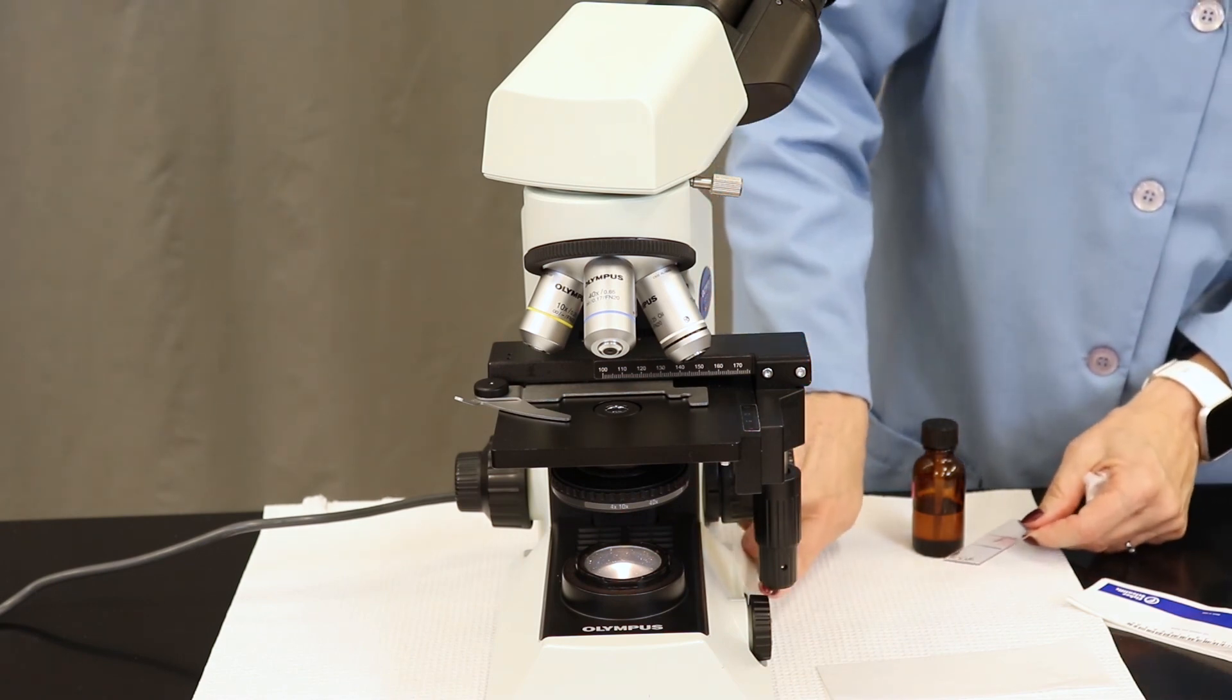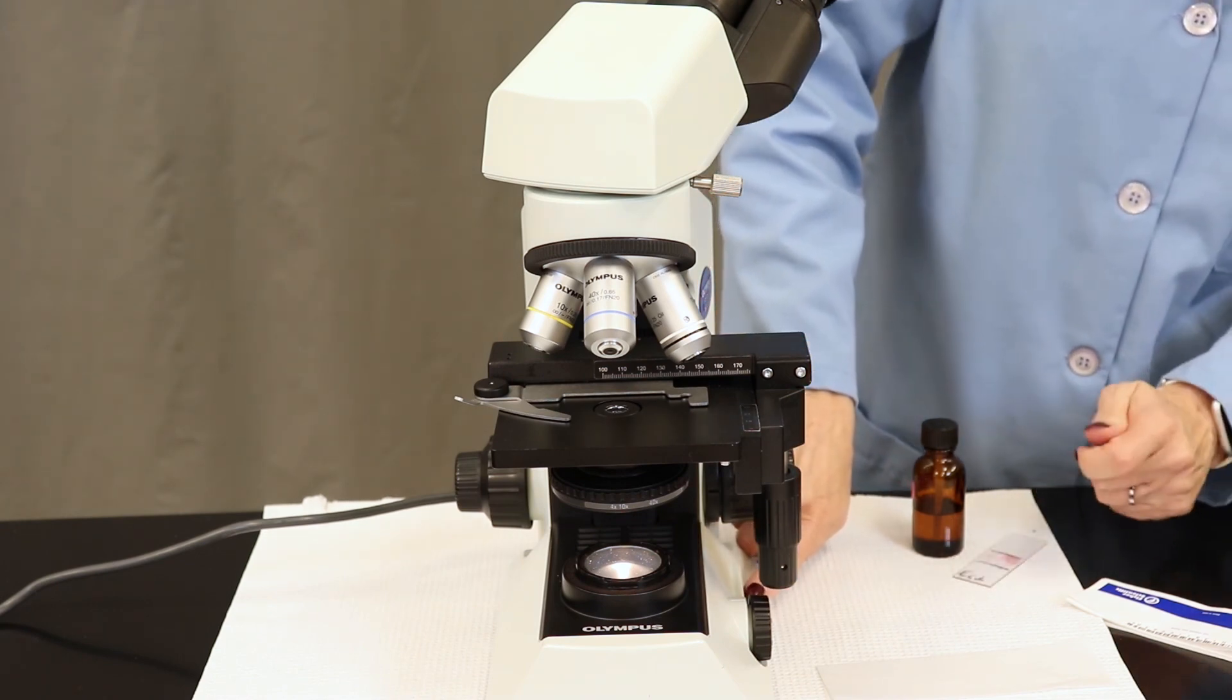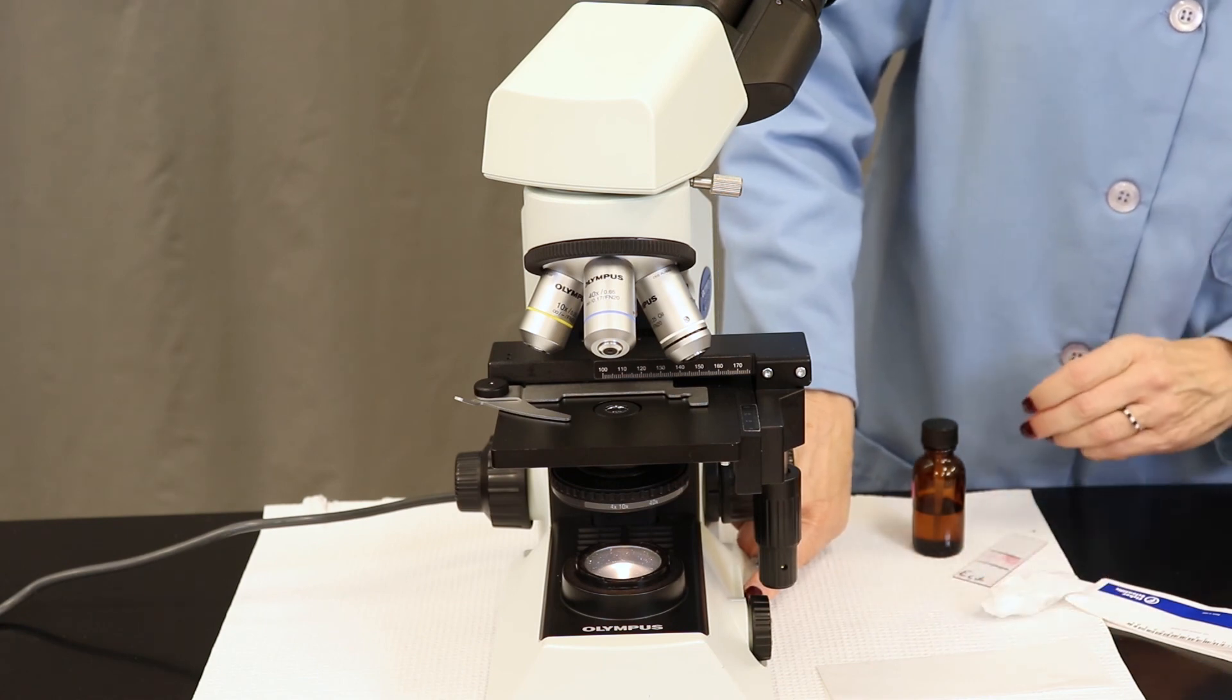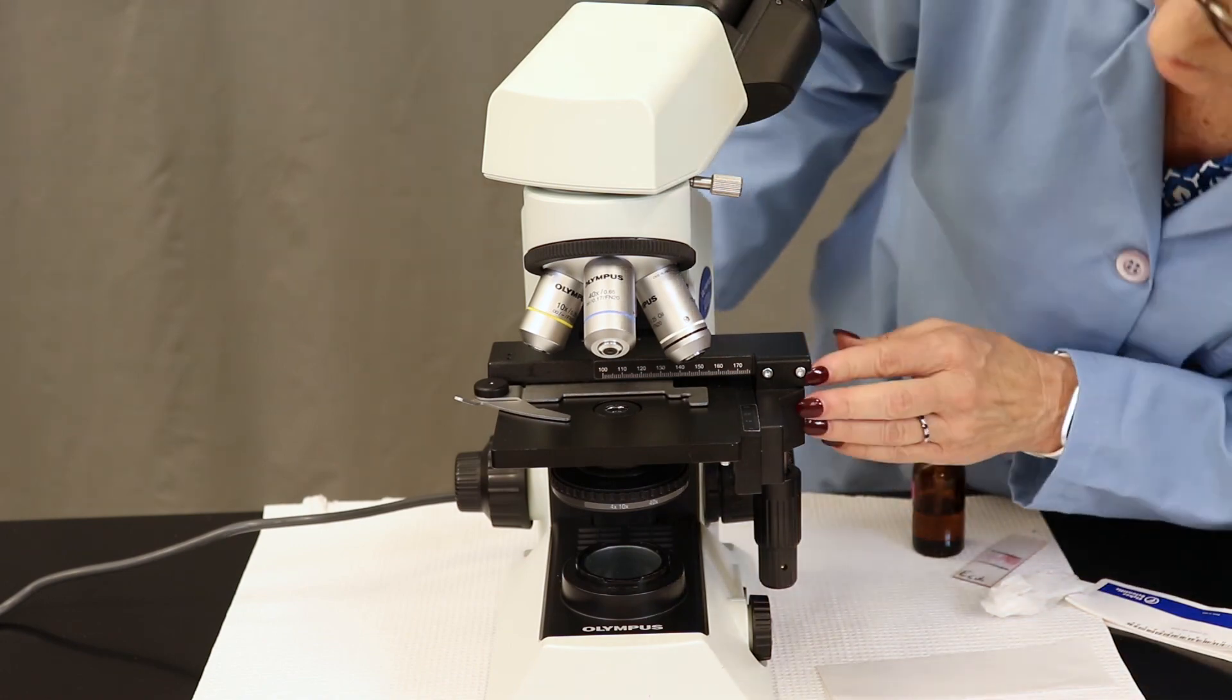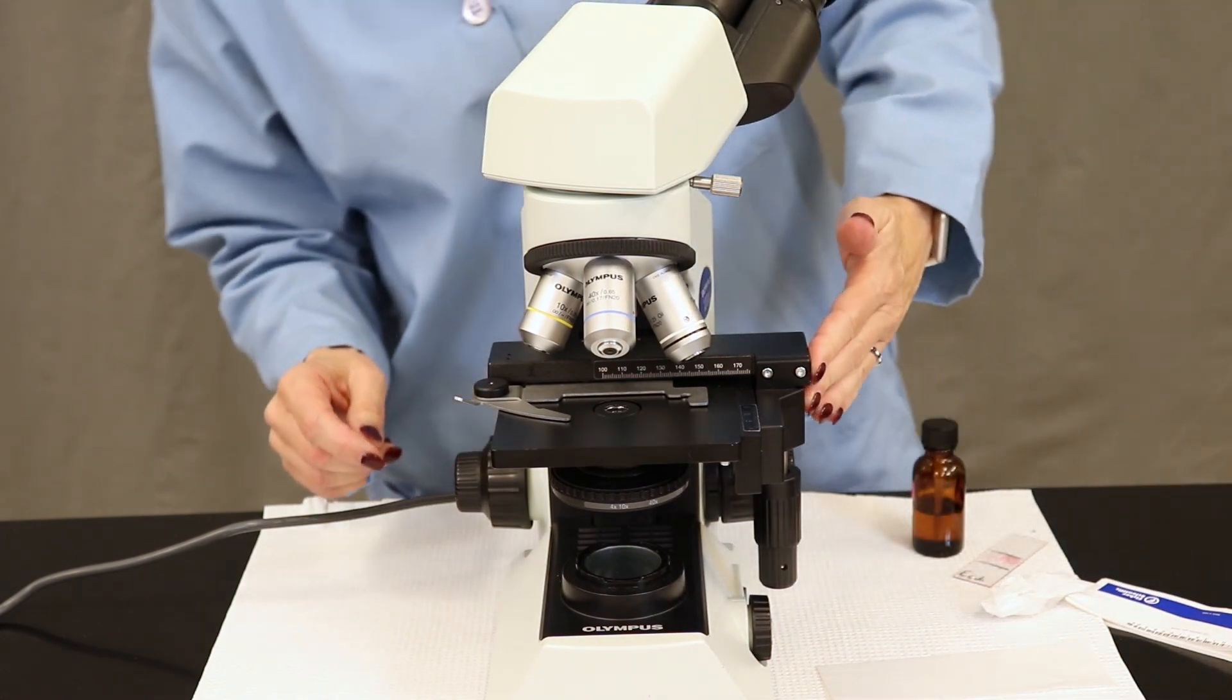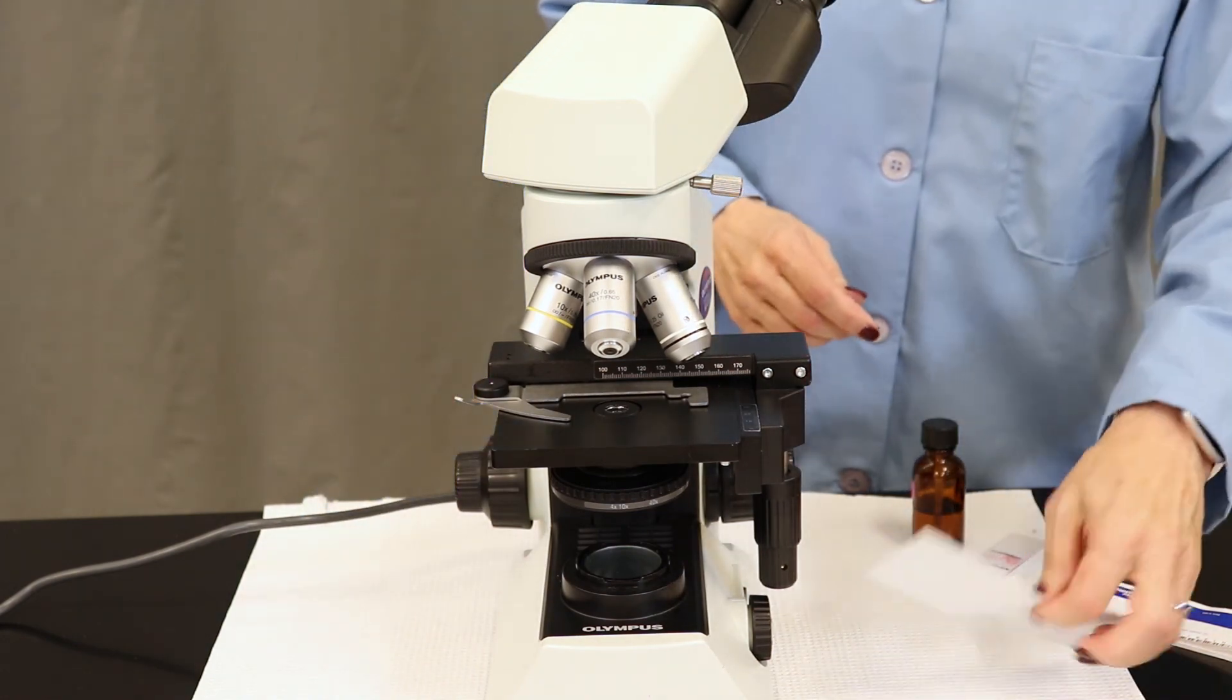Next, remove the glass slide from the stage. Be sure to dispose of it in the proper waste before you leave. Check the stage and the rest of the microscope for any other oil. Anything that looks greasy, you're going to want to wipe off with a fresh piece of lens paper.